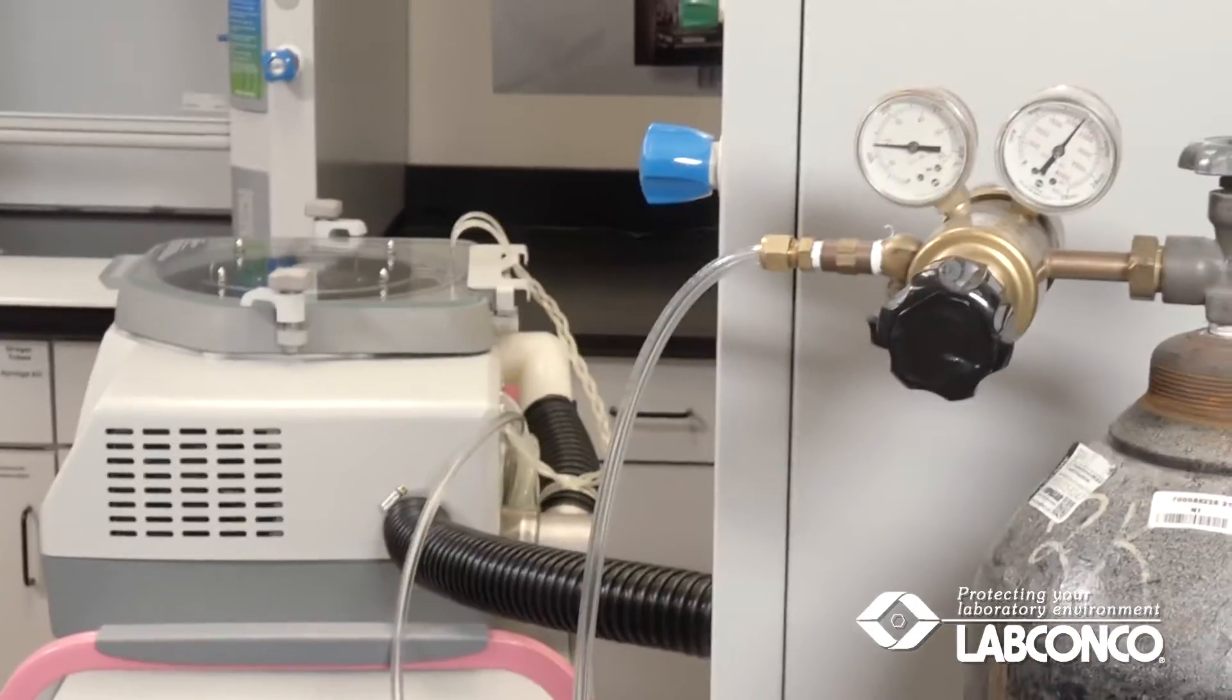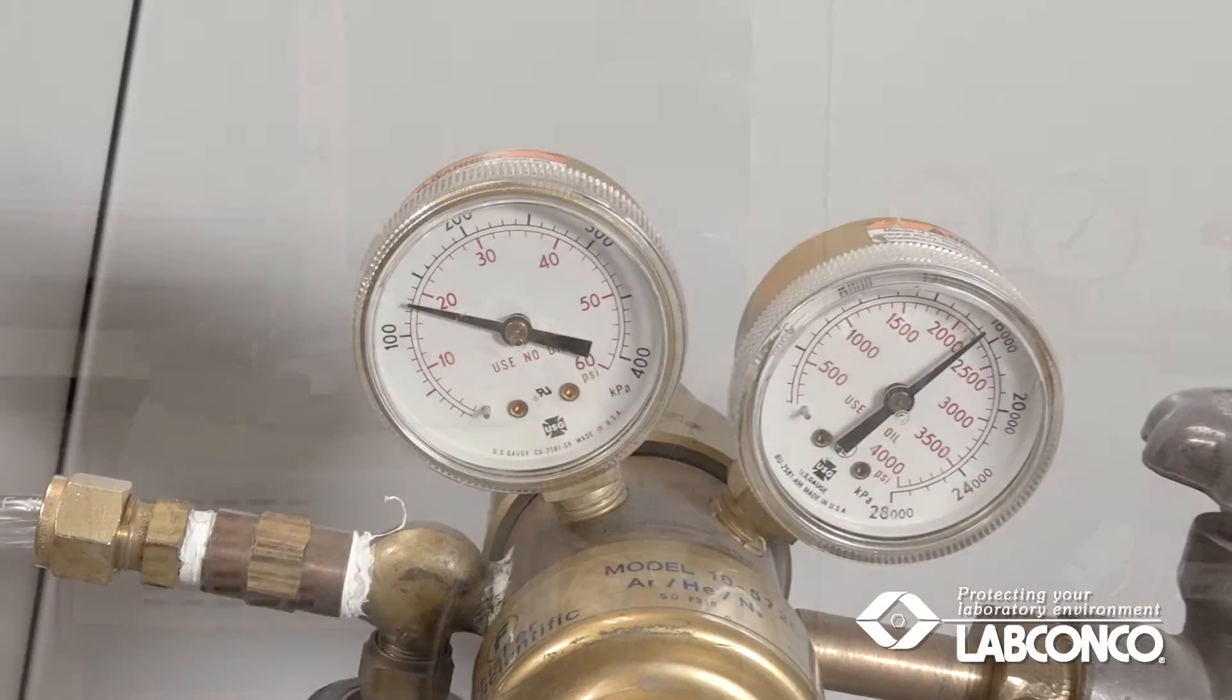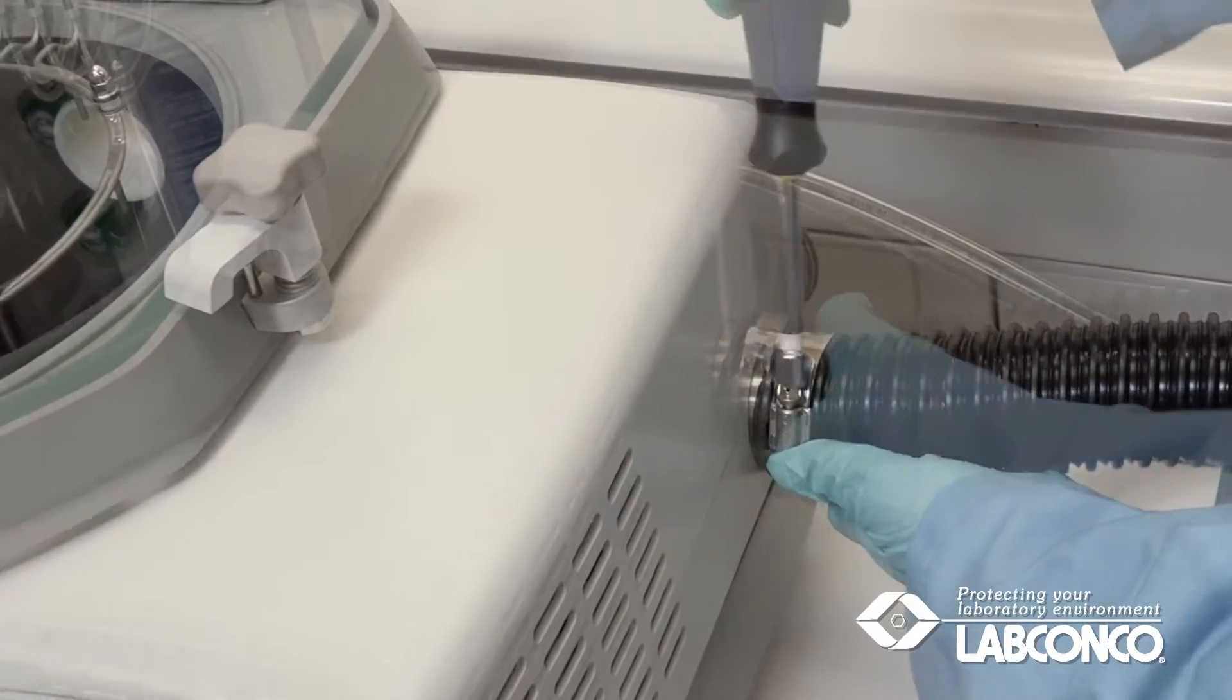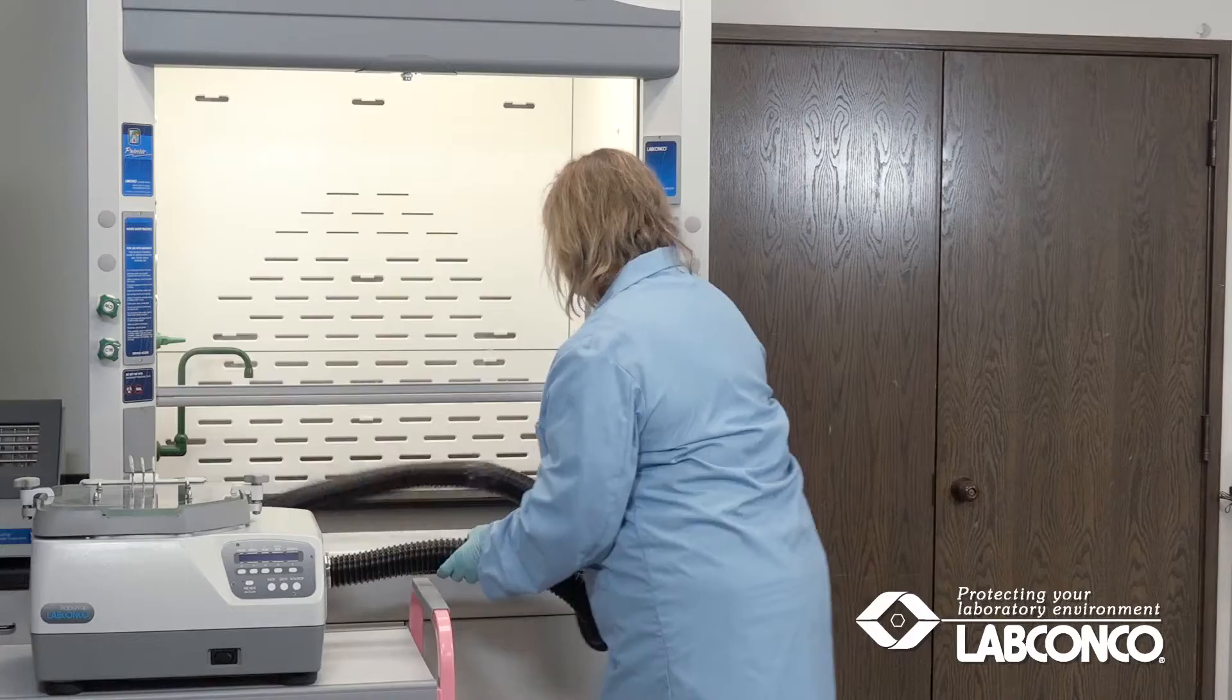The nitrogen pressure must never exceed 20 psi, so a regulator is required on the nitrogen source. Attach the supplied exhaust hose and vent into a fume hood or other ventilation device.